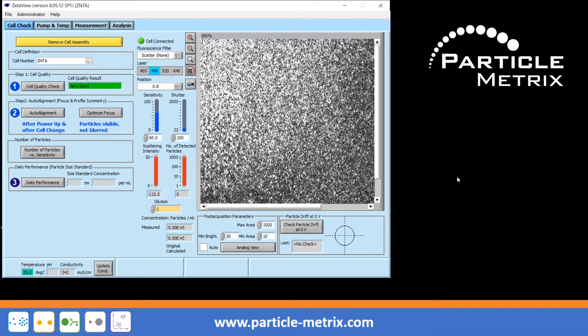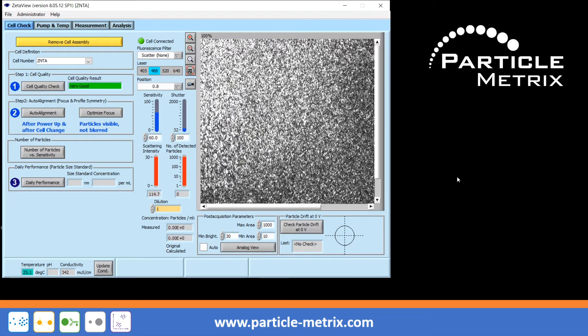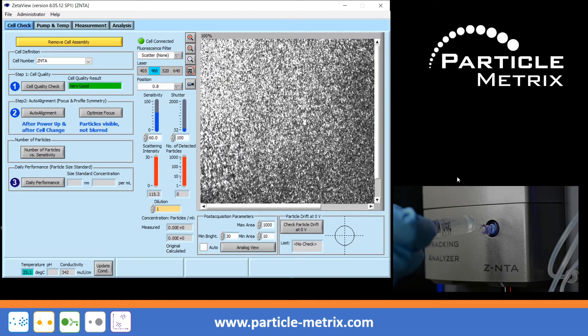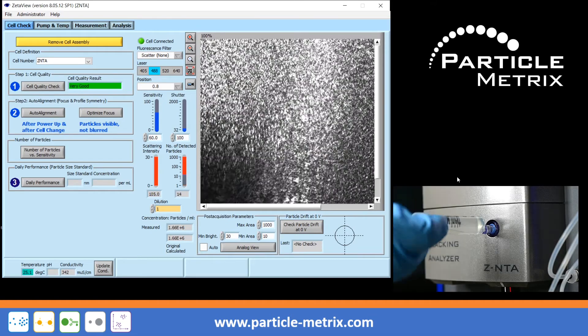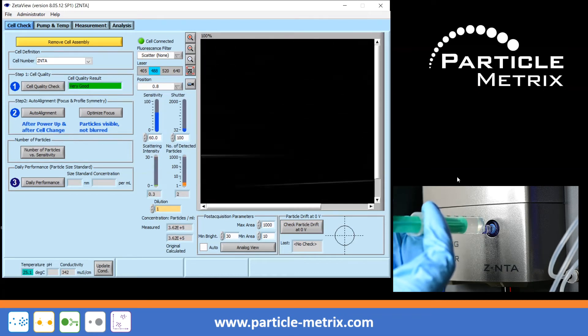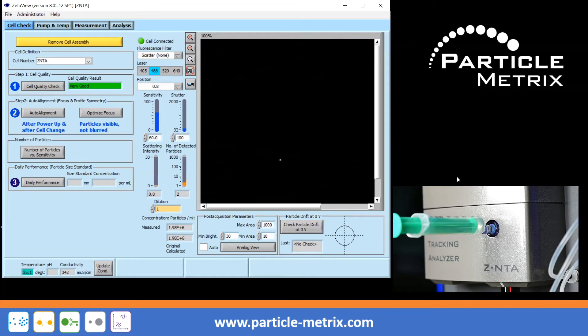If there is an air bubble in the measuring cell and the instrument is only filled with water or buffer, but not with the sample particles, simply inject another 2-5 ml of liquid by applying a little more pressure. In most cases, this will move the air bubble out of the measuring cell.